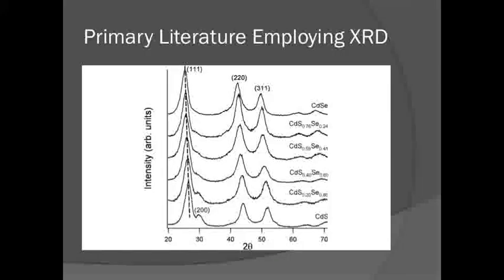The Swafford paper is an example of how X-ray diffractometers are used in research-based application. The nature of their research was to determine the precise structure, size, and composition of homogeneously alloyed CdS(x)Se(1-x) nanocrystals. The samples were synthesized by the researchers in a single pyrolytic method, which was based on work done by the researchers Yu and Peng.